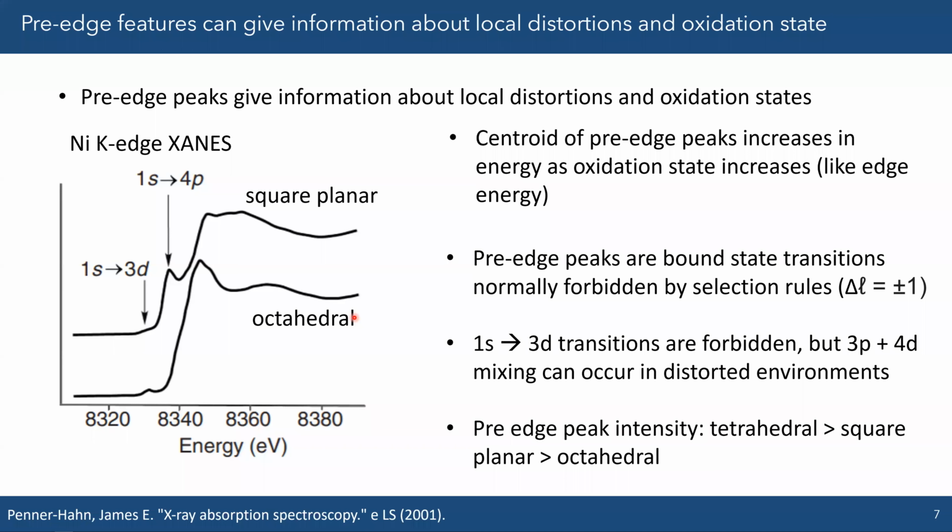So preedge can give very useful information, especially about distortion, because if your octahedral is distorted, it won't be as centrosymmetric, and you'll also see greater preedge peaks.